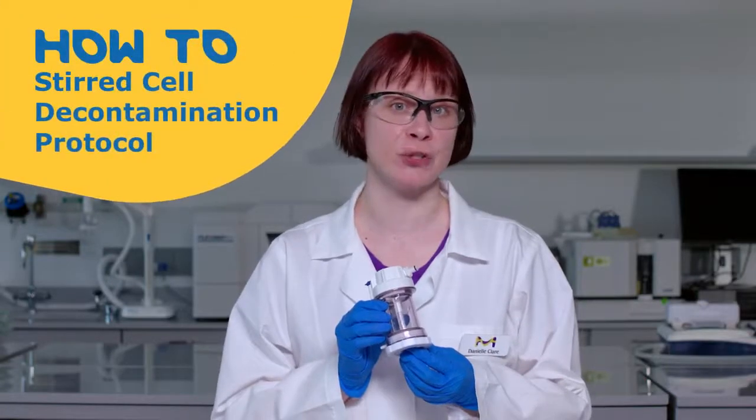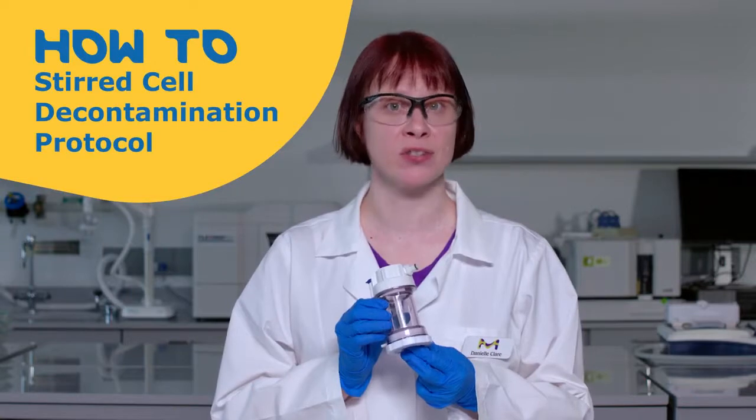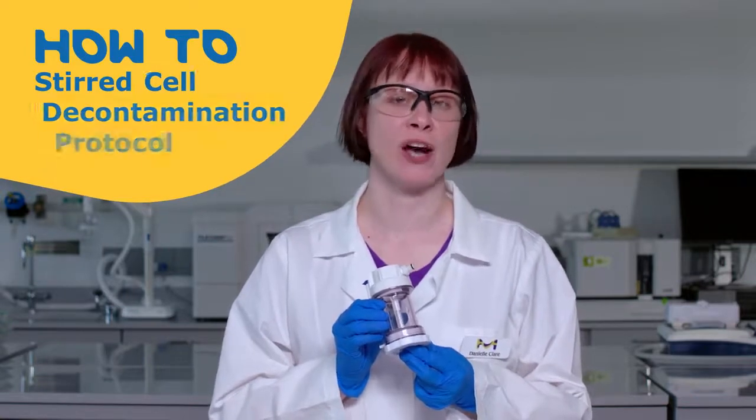Hello, my name is Danielle Clare and today I would like to teach you how to decontaminate and sterilize your reusable Amicon stirred cells before and after application use.